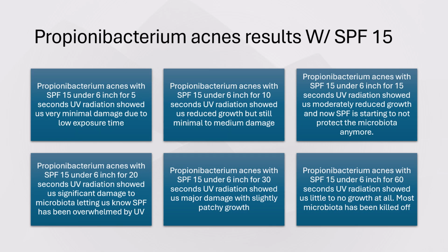Now, after going over the whole Bacillus experiment and what it would have been, we can finally get into the things that we completed. So P. acne with SPF 15, we put it under the 6 inches of UV radiation for 5 seconds, and once again it showed us very minimal damage just due to the low exposure time. And then we bumped it on up for 10 seconds. We saw some reduced growth, but still minimal to medium damage, not very much at all.